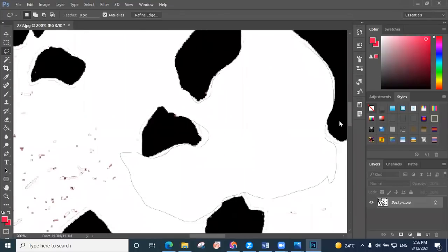All right, we just keep doing this for all the pictures for good results.